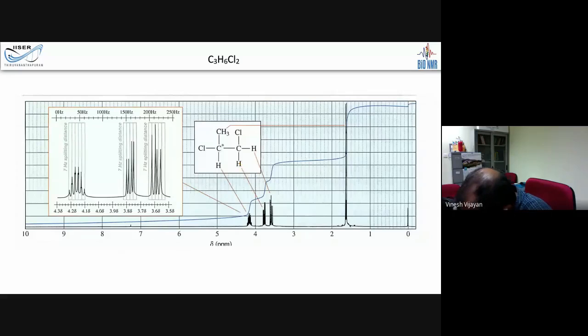If you replace this H with a D, you will get a different diastereomer. So these are diastereotopic, and the diastereotopic protons have different chemical shifts. They have different chemical shifts, and they couple with each other because they have different chemical shifts. So these 2 hydrogens have different coupling. In principle, that is what you observe.